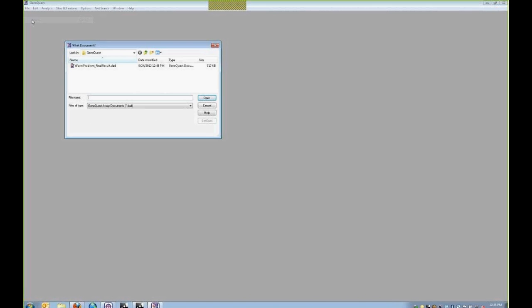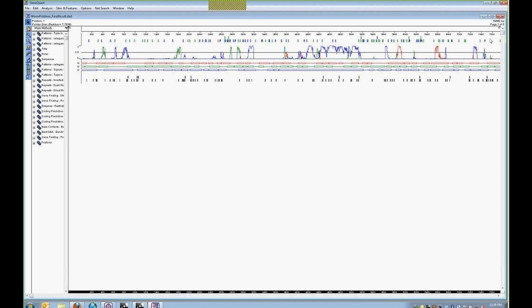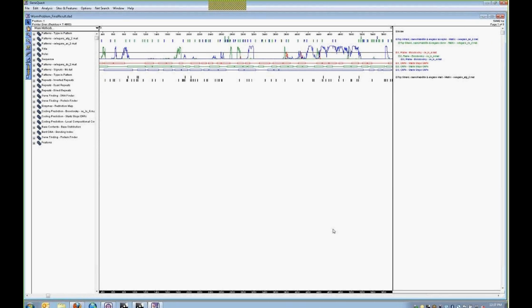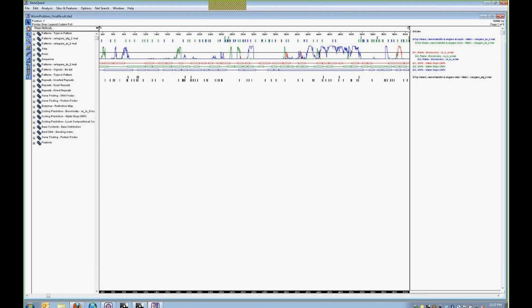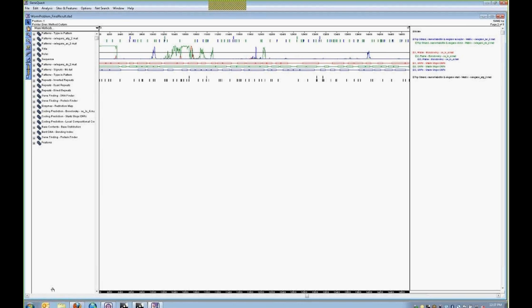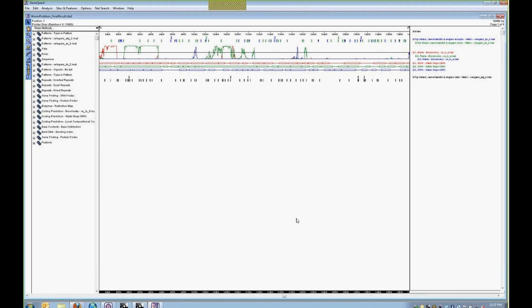discovering your genes. So with that said, I'm going to go into a program or a file that's already been created. And now there's a bit more information that is on this particular sequence that wasn't on the last one. In particular, what we've done is applied some tools that are very helpful in locating potential coding regions. And I'm just going to scroll to a specific region here, and then I'll explain.